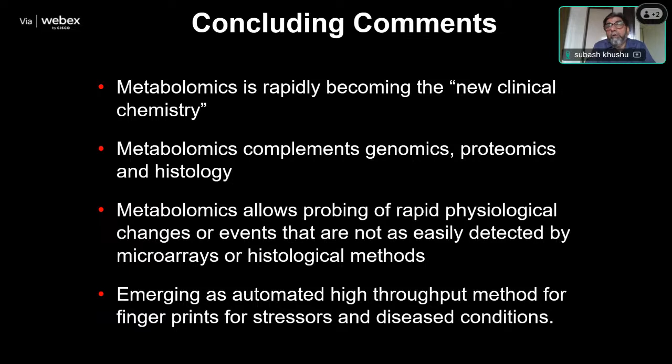As I said, in case of any nuclear accident or any other casualty where a large number of people are affected, it is very easy to draw urine samples from a large population and subject them to NMR spectrometry, and with a large number of spectrometers you can do maybe 10,000 samples within a night.